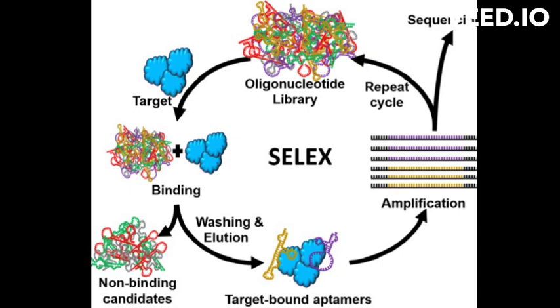Overall, SELEX is a powerful technique that allows for the identification and isolation of specific nucleic acid sequences that bind to a particular target molecule with high specificity and affinity. It has many potential applications in areas such as diagnostics, therapeutics, and basic research.